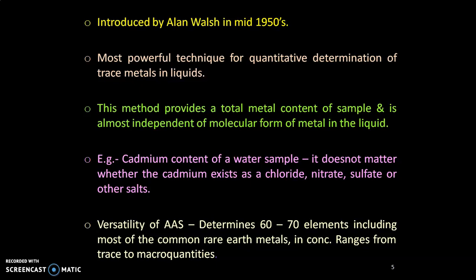This is the most powerful technique for quantitative determination of trace metals in liquids. This method provides total metal content of the sample and is almost independent of the molecular form of the metal in the liquid. Example: cadmium content of a water sample. It does not matter whether the cadmium exists as a chloride, nitrate, sulfate or other salt.